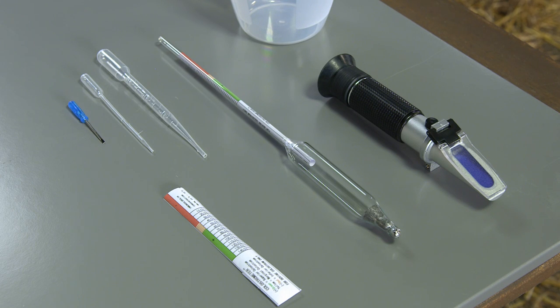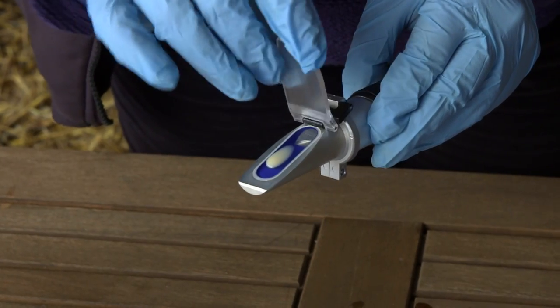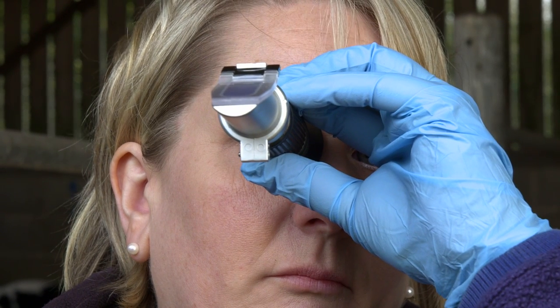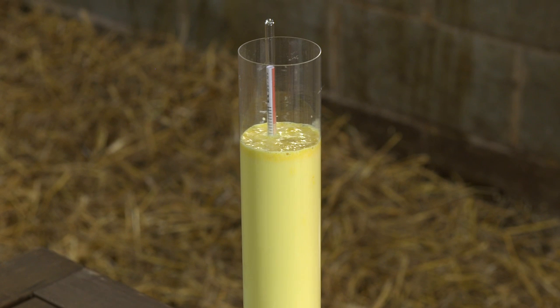So whether you use a colostrometer or a refractometer to measure your antibody levels, there are two things you must remember. Firstly, to test each sample of colostrum you're storing, and secondly, to do so in a hygienic manner. This allows us to feed only good quality colostrum to our calves and enables us to discard poor quality colostrum.